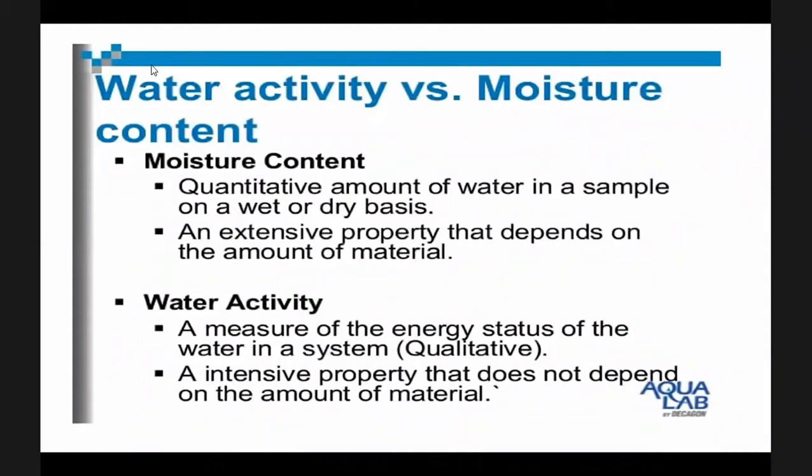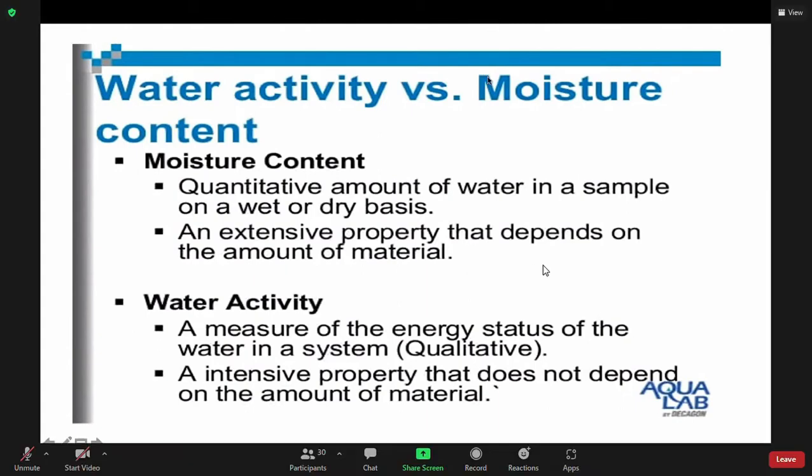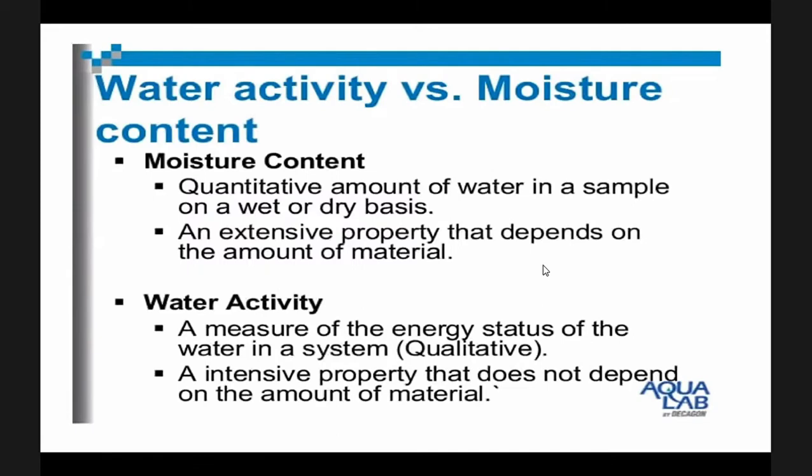Analyze, you don't know what the importance is yet, no? Okay. So our specimen will be food samples. There is flour; I think the analyst, Ms. Feresa, prepared cocoa flour, and there is also a Fuji bar. What else? Cookies also.